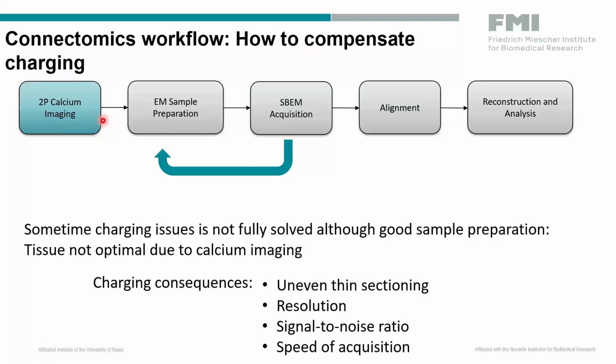And we actually realized that sometimes the samples that were submitted to calcium imaging were a bit more prone to having charging. So sometimes the charging issue is not fully solved, although you have a good sample preparation, and sometimes the tissue is not optimal due to the calcium imaging.